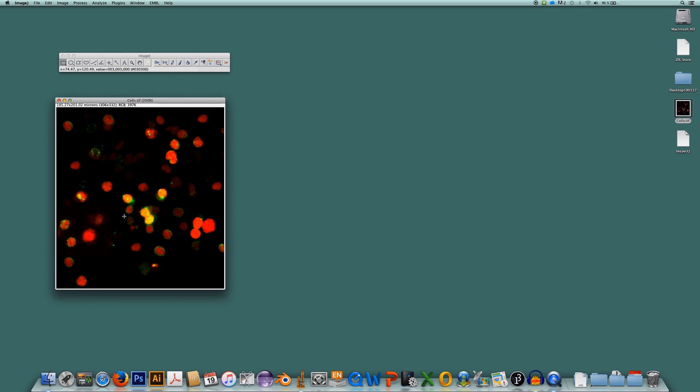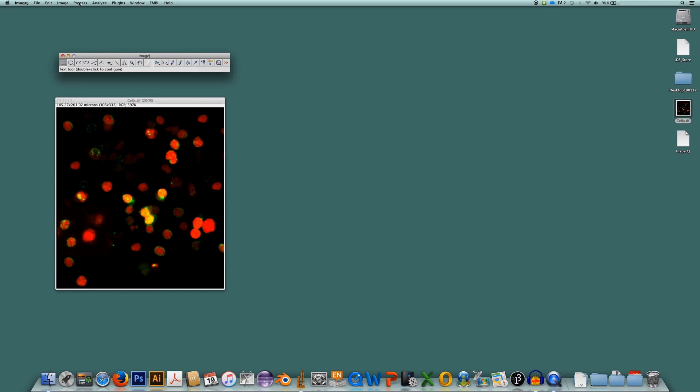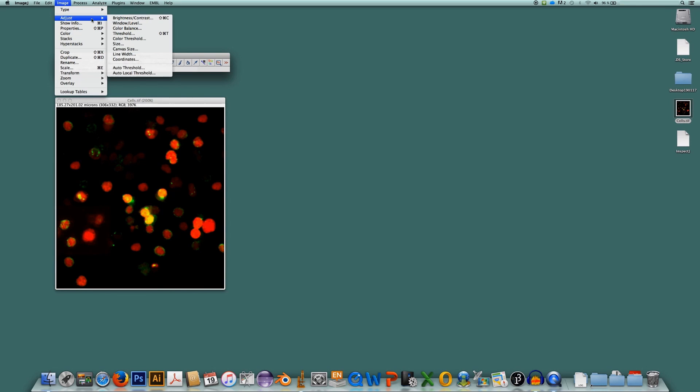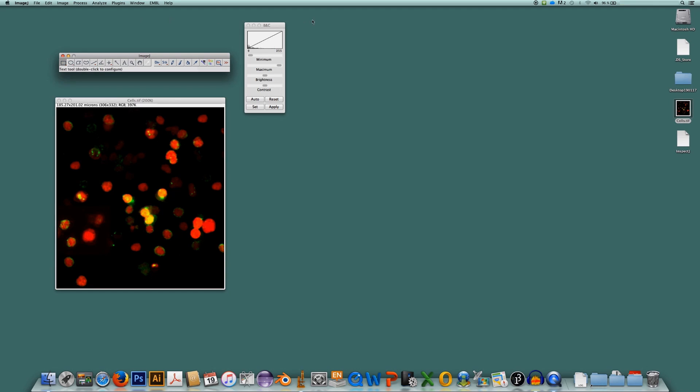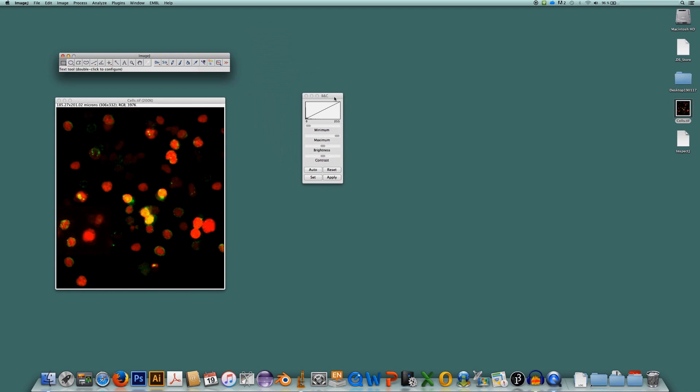Before we start the analysis with InspectJ, let's apply a more conventional way to check for image integrity, which is simply by playing with contrast settings. So I will go to ImageJ, Image, Adjust, Brightness, Contrast and I will increase or reduce the contrast by moving the slider here. Please have a look at the image while I'm increasing the contrast.